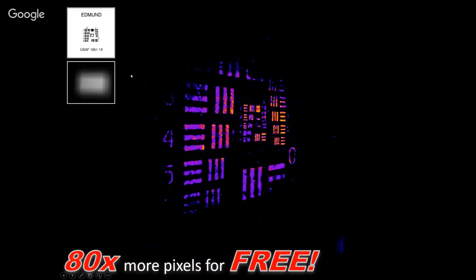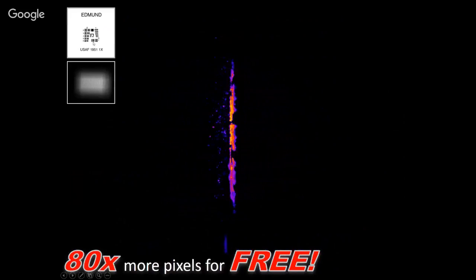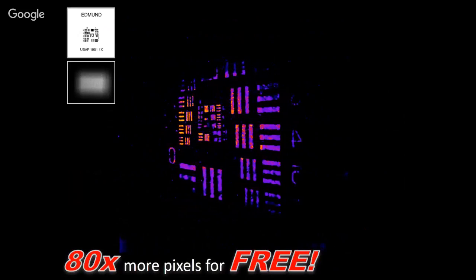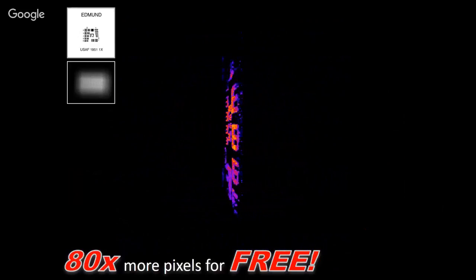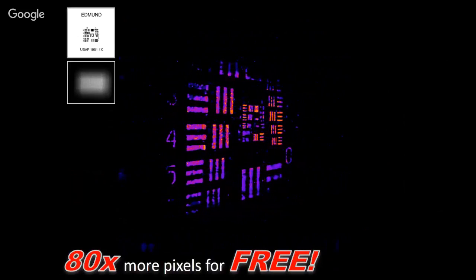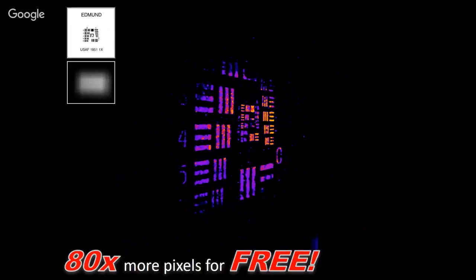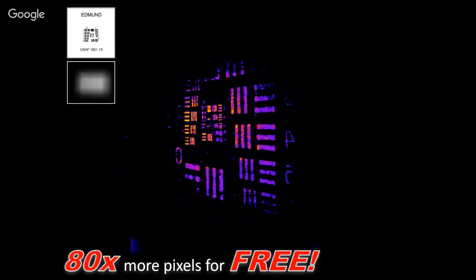So here's the raw image that we take, and our object now is this US Air Force target, but it's tilted in the third dimension. It's sitting 45 degrees diagonal to the camera, and this is just a rendering of the 3D reconstruction. So we actually do get the optical resolution out to approximately what we would expect, and across a pretty big volume, although this object doesn't occupy much of the volume. Our reconstructions end up having about 100 million voxels in them. You can clearly see we're not using all of them here, but we could because it's in this weird conical shaped field of view.